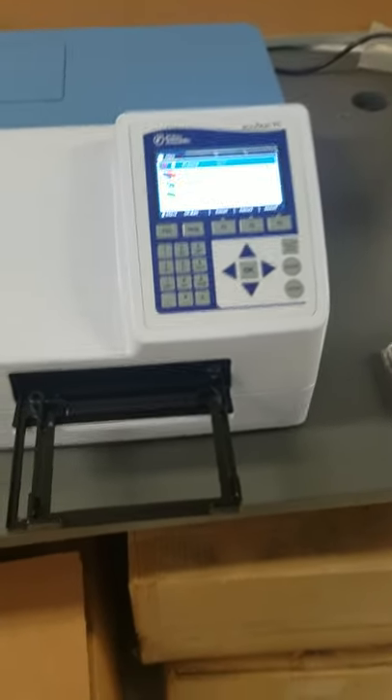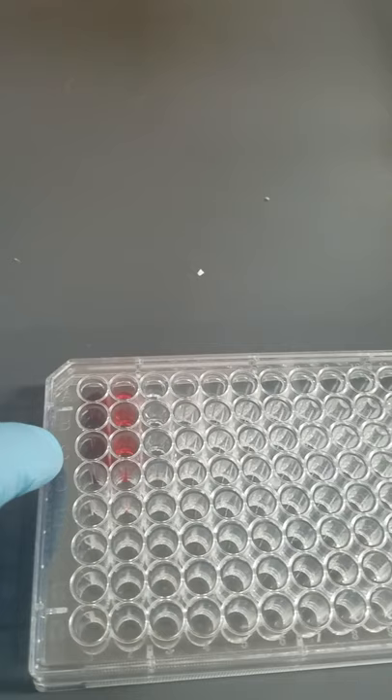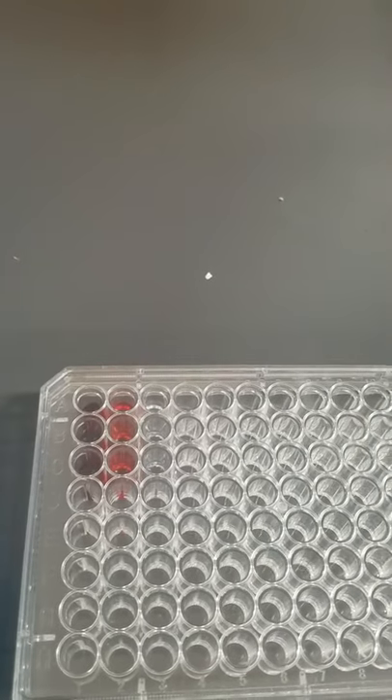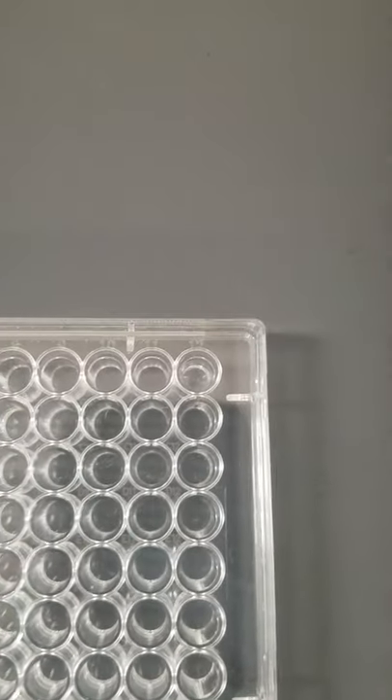Now what we want to do first is place our plate in the plate loader. What we have here is A1 through C1 is just red dye. A2 through C2 are red dye 1 to 500 diluted in PBS. A3 through C3 are PBS. And then at A12 over here, we have what we're going to use to calibrate, which is known as a blank.